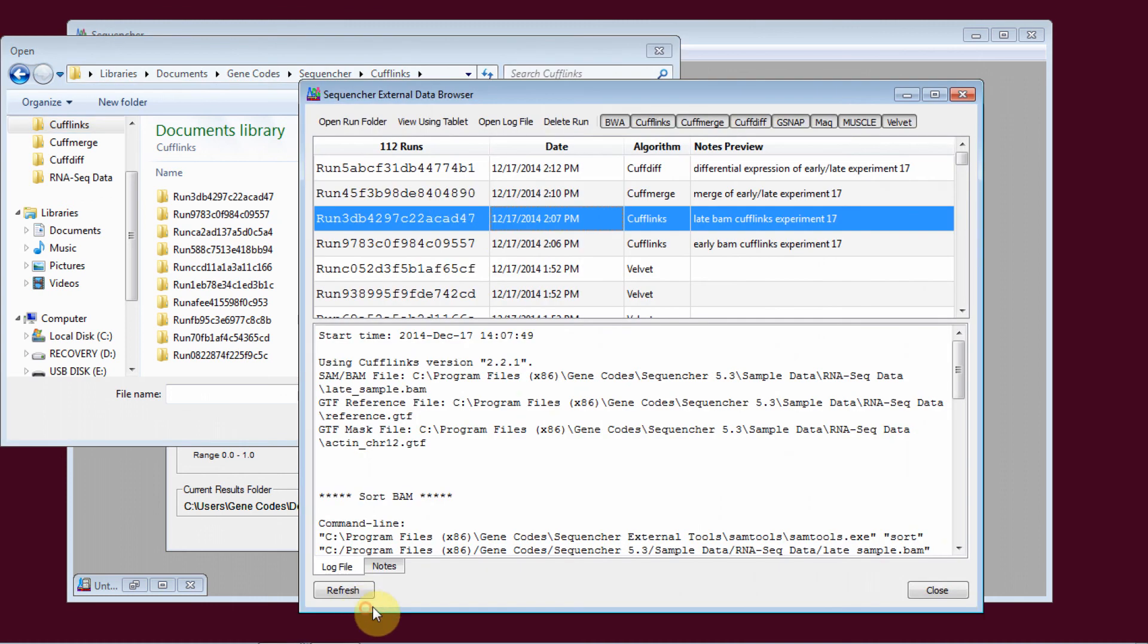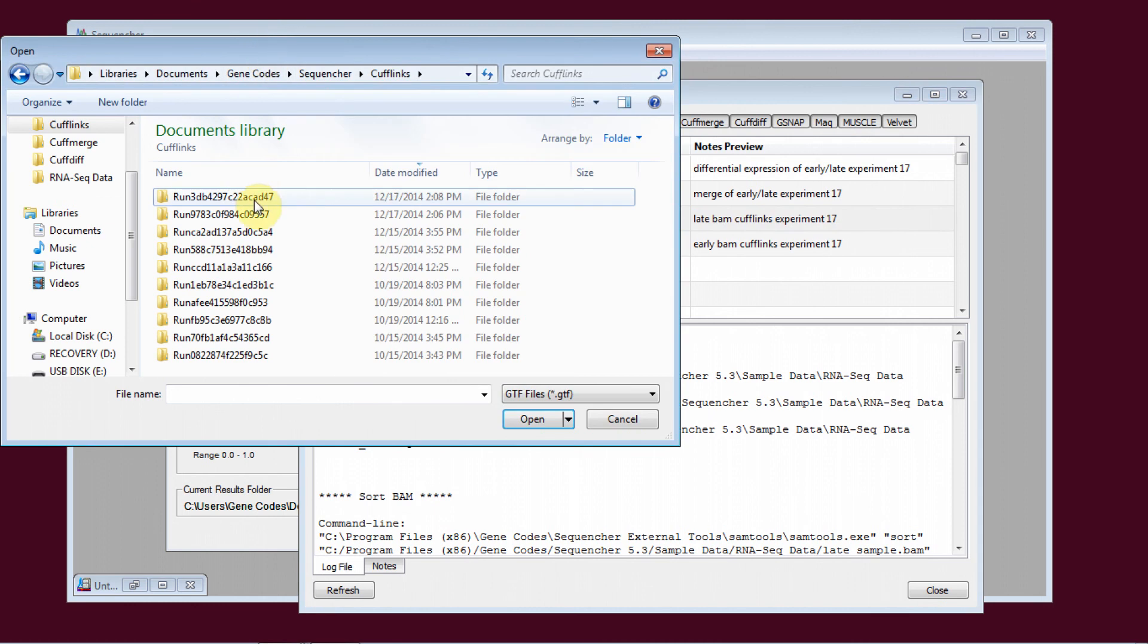But if I wasn't sure of that, I could use the external data browser to tell me that those were the two run names that I was looking for.